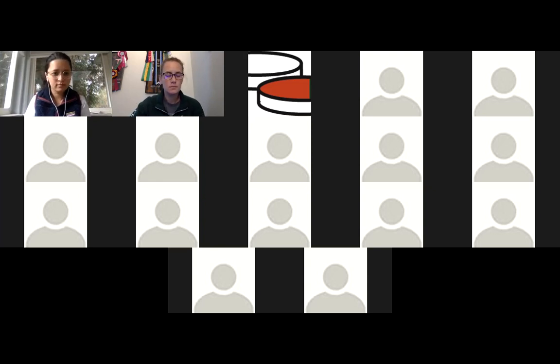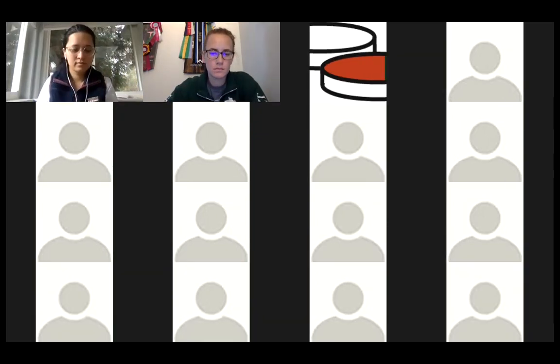Hey, Aishwarya, I have one question, though it might be better suited for your office hour potentially. I'm really excited because I have sequencing data that just came off maybe like a week and a half ago. And so today was super helpful just to get oriented in what I'm about to do. But it sounds like I need to run Cell Ranger first. I'm also really eager to use the BBI pipeline so I can finally use a really nice dashboard. Does the pipeline and the dashboard incorporate Cell Ranger? Is it wrapping around Cell Ranger, or do I want to use Cell Ranger first? And where do I go to access the pipeline?